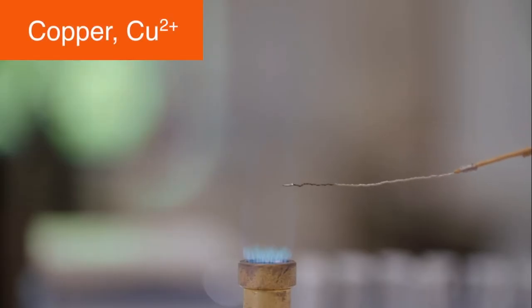Copper compounds can produce either a green or blue green colour in the flame depending on the anion present. For example, copper halides produce blue green colours, whereas copper non-halides produce a green colour.